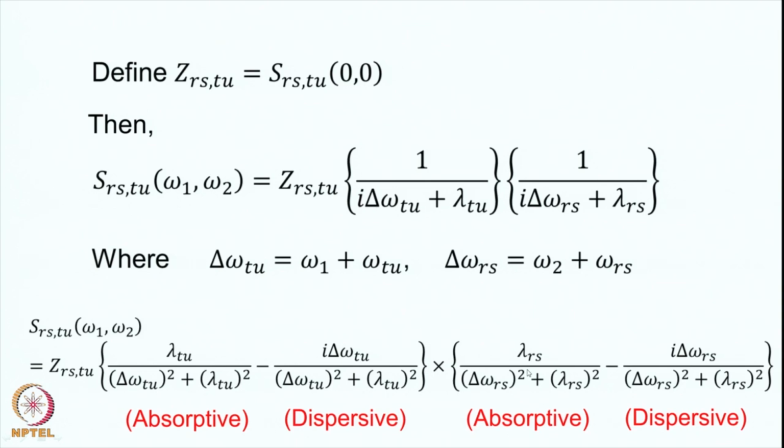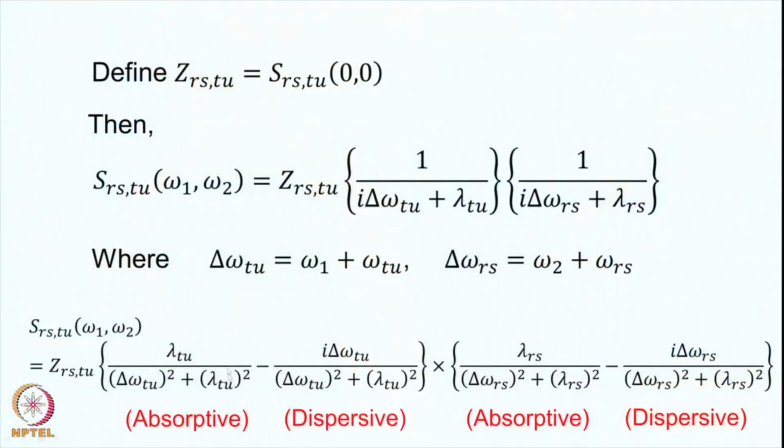Now, we recall from the discussions in the very first chapter what these line shapes are. So, here you are plotting as a function of the frequency. What frequency? Omega Tu. These are the various frequencies which may be present in your spectrum, and omega 1 and omega 2 are the running variables of the Fourier transformation. So, what do you get as line shape in your spectrum?